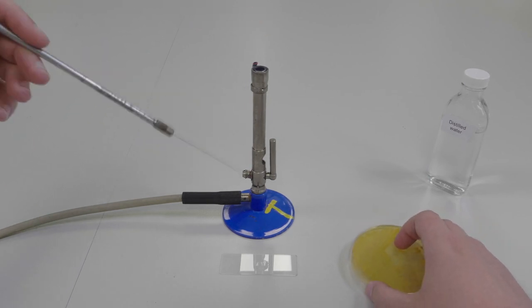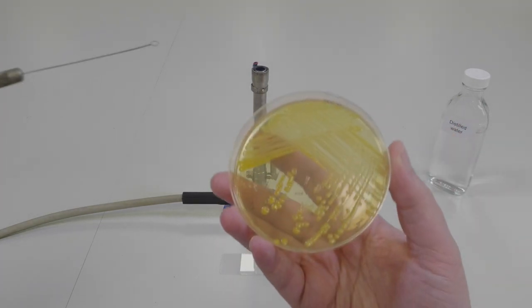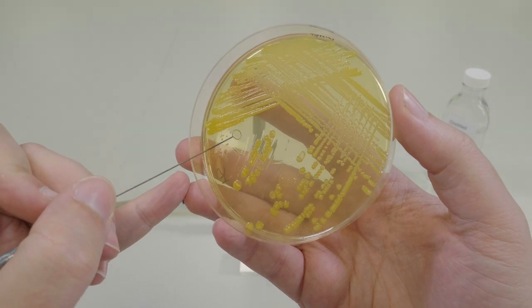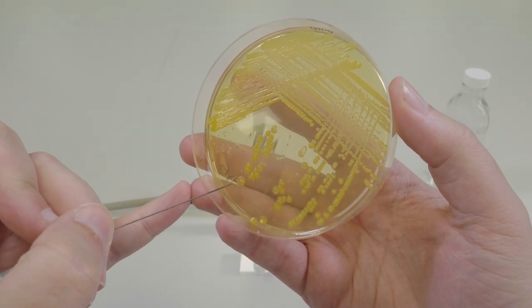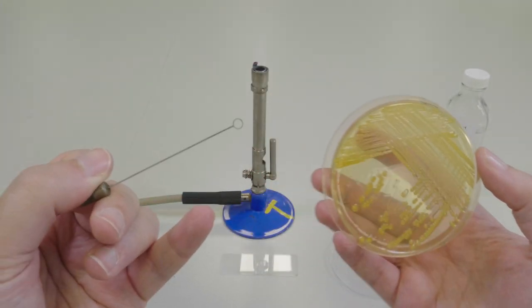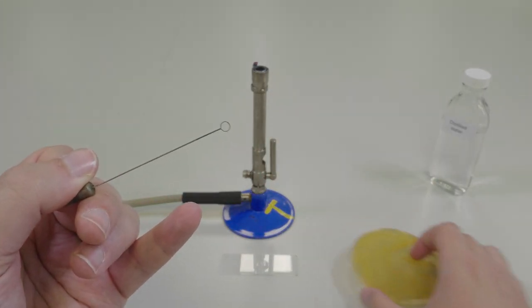Next pick up the plate containing your bacterial culture and holding the inoculating loop like a pencil, pick off a small quantity of bacteria from a single colony. Please note you do not need to take a lot of bacteria from your plate.